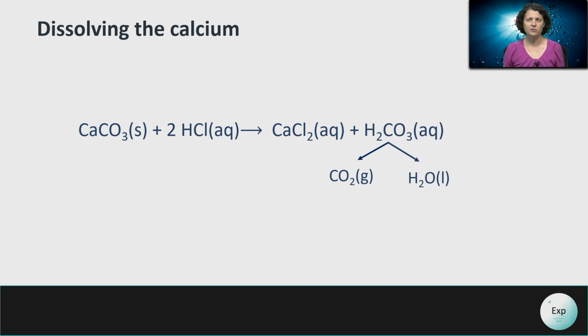The result of this reaction will be calcium chloride and carbonic acid, which is a very unstable acid that easily decomposes into carbon dioxide, which will be eliminated as bubbles from the solution, and water, which is a liquid that will add to the volume of our solution.